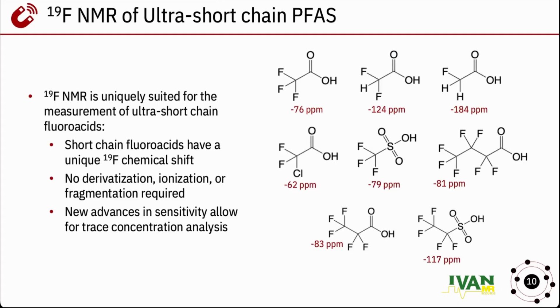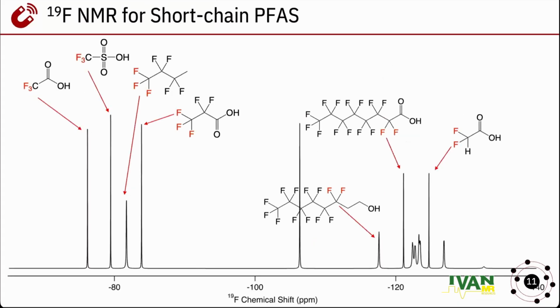So that in itself makes it quite powerful, in addition to not seeing the background noise, not worrying about solvent peaks, not worrying about whether it's ionizing in the mass spectrometer, or whether we can see its transitions. So we don't need to derivatize it. And it really works quite well in fluorine NMR. The trade-off always has been, though, sensitivity. This is something that we're really pushing: how low can we actually make our 1D NMR so we're able to see these things in the environment?